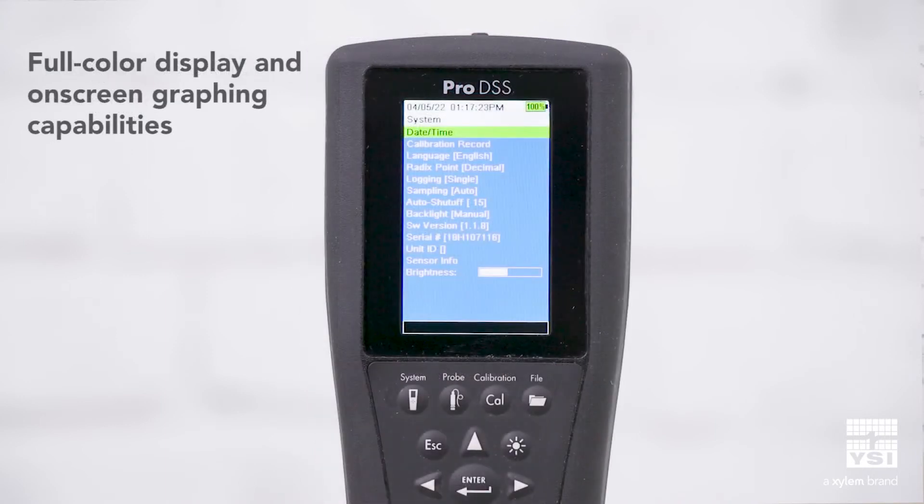Pro DSS takes this even further with a full-color display and on-screen graphing capabilities for viewing sensor stabilization or log data.